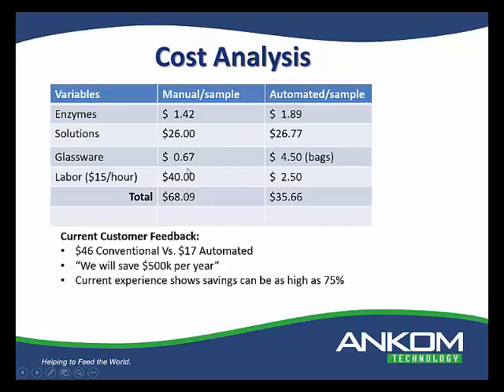Glassware, we're assuming... We should talk about that line charge a little bit. The line charge is done when the instrument's set up, but each day that you start, let's just assume the instrument's off, when you start the instrument at the beginning of the day, it's going to do a line charge because it has to make sure all the solutions are at the right point. So that initial line charge is going to put some solutions out, and then when that first run happens, it's going to basically move solution again, because it's going to be setting up for the next one. So that small amount of solution, some of it is going to go out the waste tubes of the system.